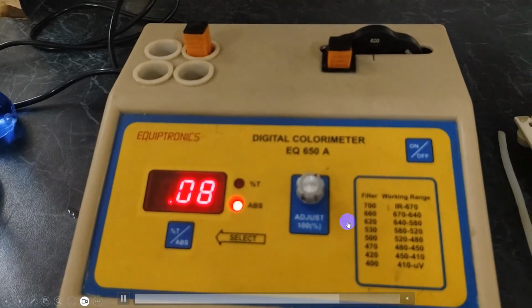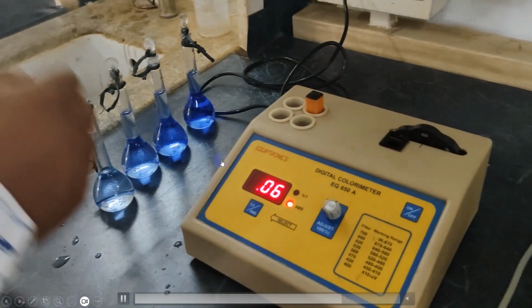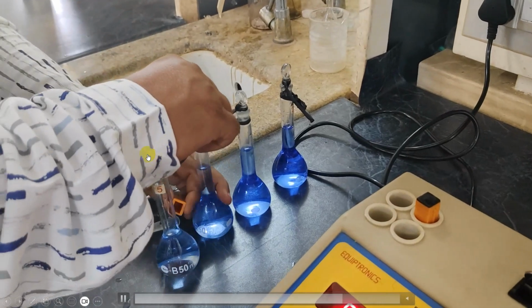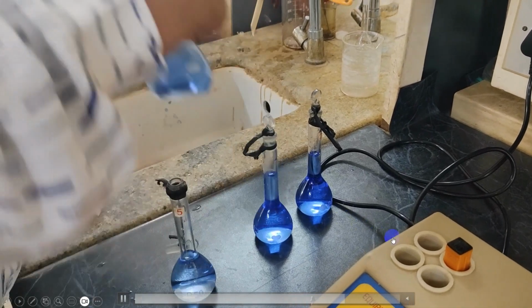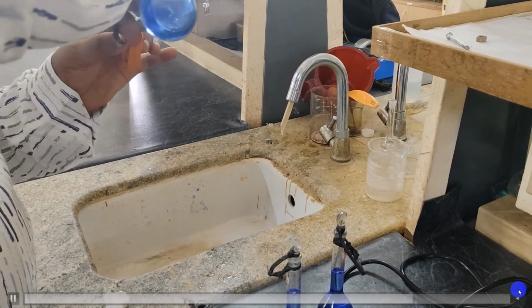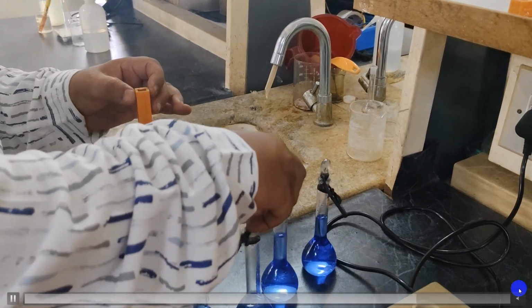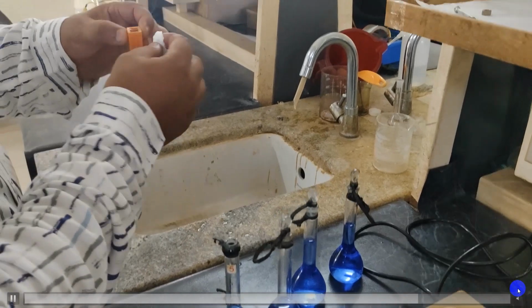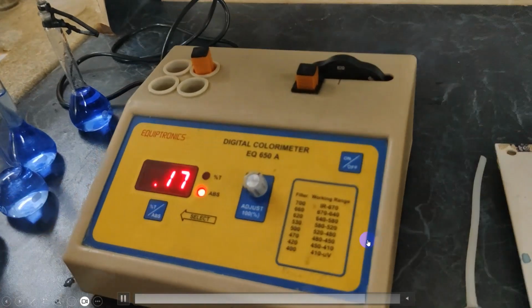Record the absorbance that you measure, then replace the solution with the second solution. Before going, set the instrument to 0 by using the blank solution and repeat the same for the remaining 4. Note down the reading of all the 4 flasks.